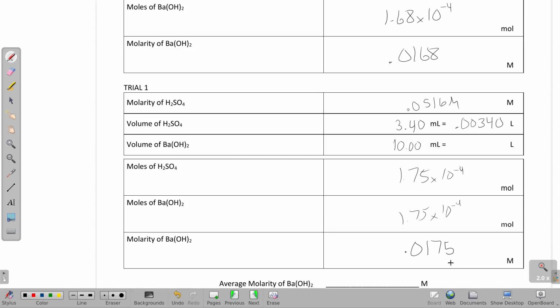another run. So anything more than that, we probably should have done another run to see which one I was wrong on. And to be quite honest, I'm not really sure which one I messed up on here. We're reasonably close, within 1/10 of a milliliter. What would have drastically helped my results is if I had used the right chemicals. So it's something that I go out of my way to make sure you guys get. If I give you that 0.02, and keep it like it's supposed to be, this is going to be almost double or more than double the amount, and that's really going to help our precision. We just got too little in there, added up a lot of error into this.